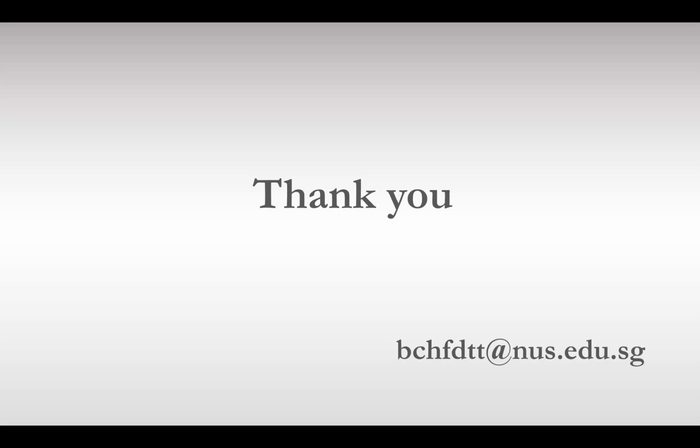One is getting better and better with the major species that people look at, but also expanding into the realm of what would more or less be considered the horizon of a fully comprehensive ceramidomic analysis. Yeah. Hi, Alfred, and nice to hear from you.